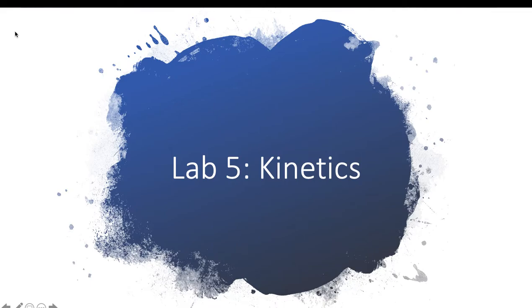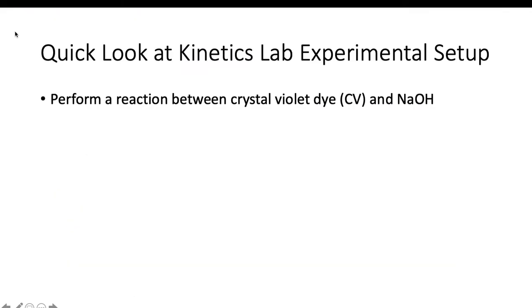For those that haven't done the Beer's Law experiment, if you're taking this in the summer, some of the sections might not have done this one. Hopefully in the normal semesters, this is a lab we typically do now for 1212. I'm just going to give you a very quick overview of it, with some quick visual images and some numbers to think about, and then I'll get into the actual data analysis for this experiment.